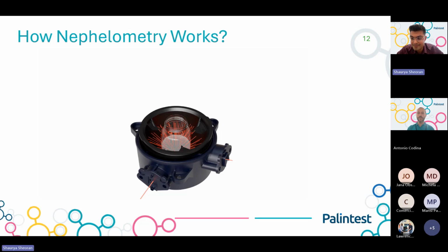Yes, Antonio. I'm just going through the comments and trying not to miss anything. Lawrence is also asking if the solid standard will be solved separately, but that we have to discuss internally. I have a feeling that the measurement at very low turbidity is specific to the drinking water industry. So there might be customers that don't need that standard, and I think it will be a separate item. But that is something we have to discuss with what the customer needs are and with our team internally.